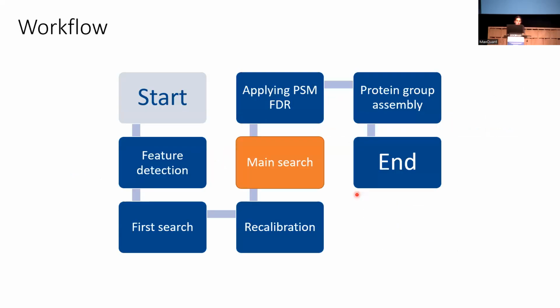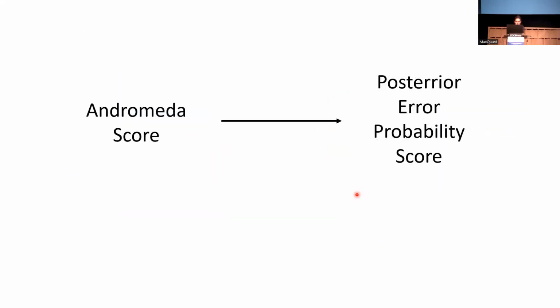So yeah, we finished with the first search. We used it to do the recalibration, and now we're going to go to the main search.